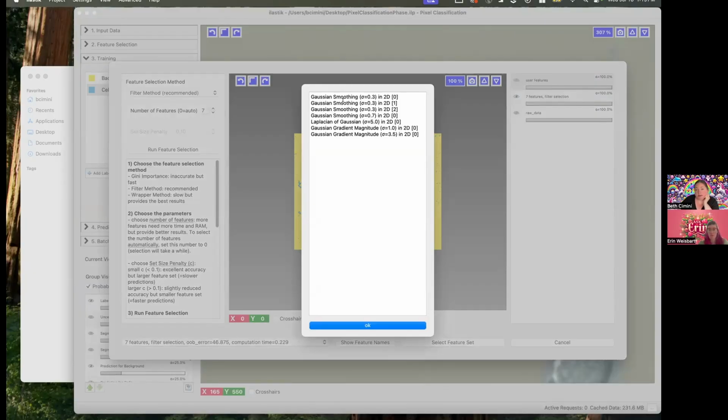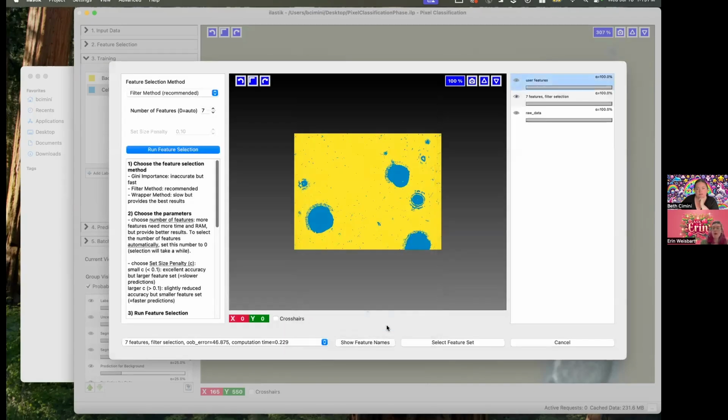So actually it's about different smoothing things. So there you go. It wasn't exactly what I predicted, but it's how the image changes when you smooth it. Interesting. Which I imagine has some relationship to texture, but a different way of mathematically approaching that.